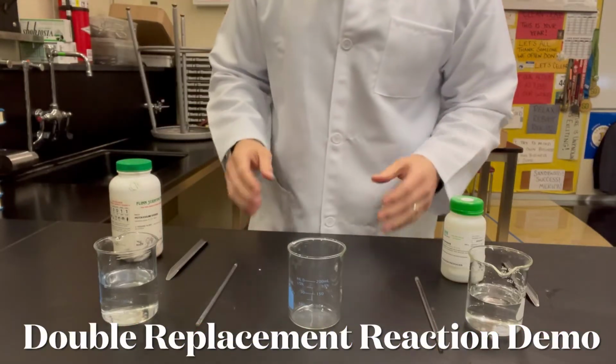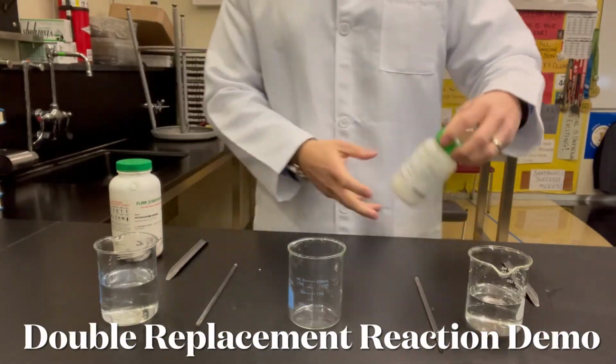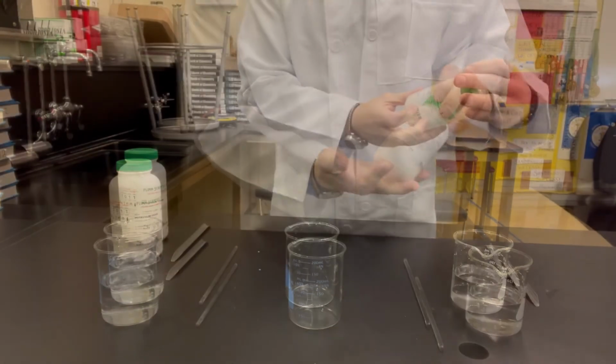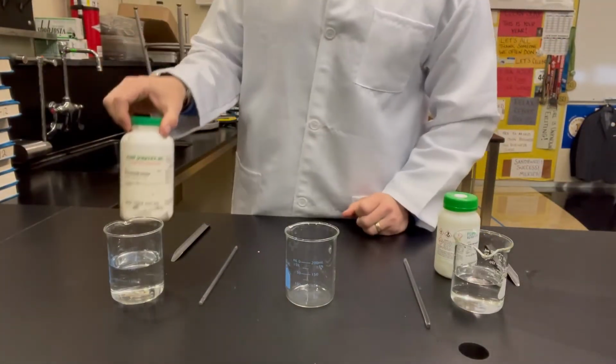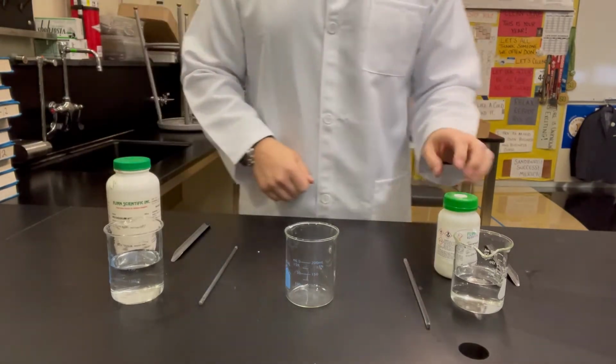Today, let's take a look at a real-world double replacement reaction. So what I have here is lead 2 nitrate to be exact, and I have here potassium iodide. Now these are both ionic compounds.